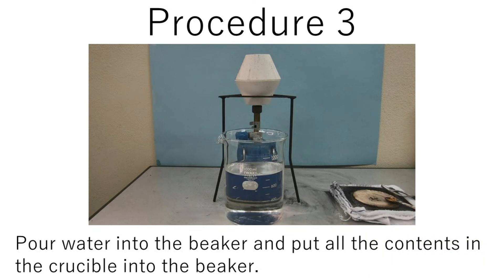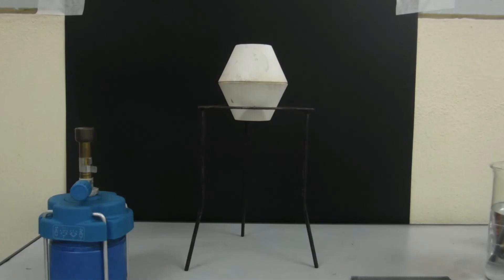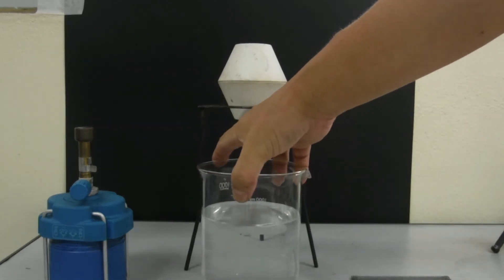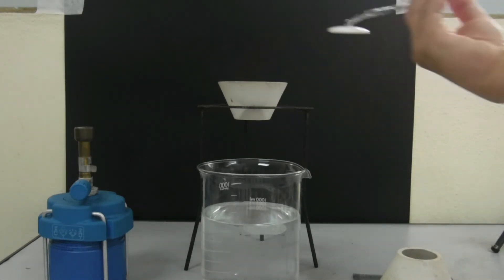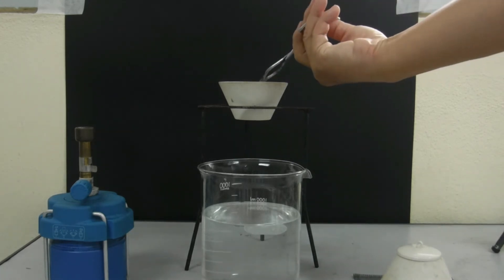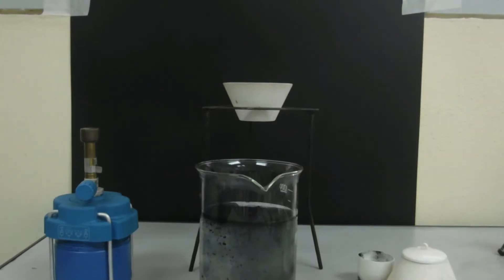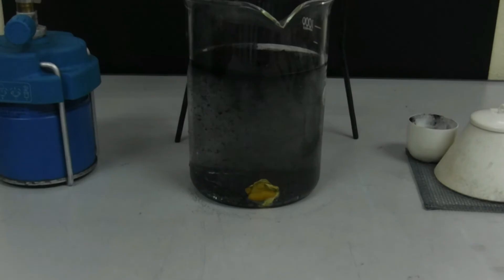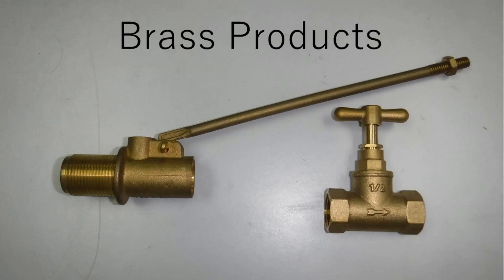Procedure three: pour water into the beaker and put all the contents of the crucible into the beaker. Brass is used as a material for many tools and coins.